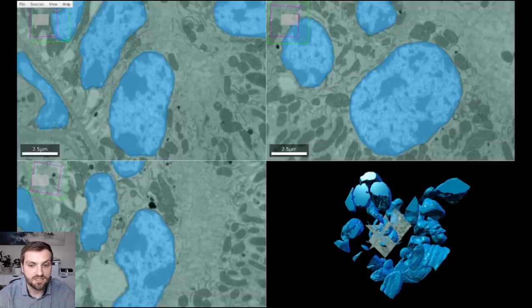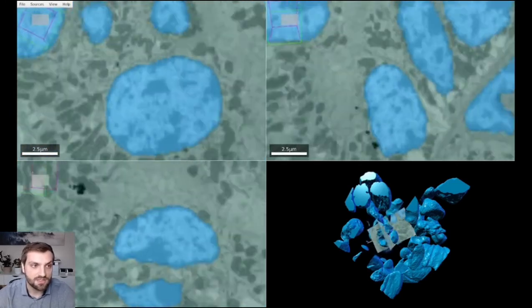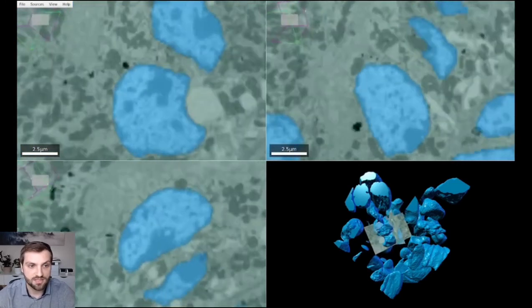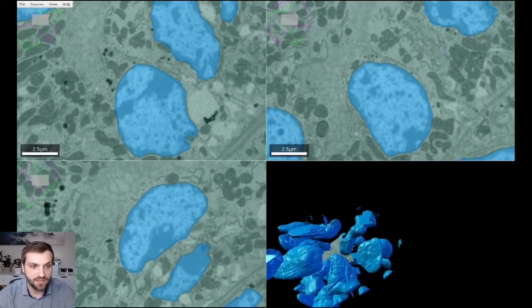Next, you'll see a similar set of data containing annotations of nuclear volumes. Here you can see rotating through the slices to show arbitrary rotations into the annotations.